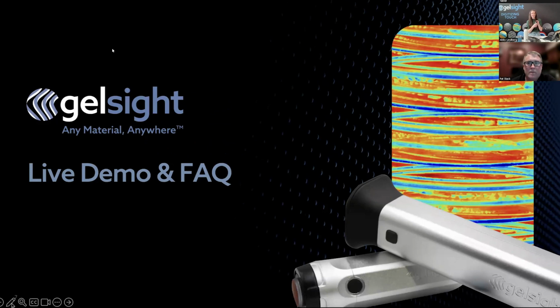And then the accuracy in the system for the Series 2 that I'm holding now is 1 micron plus 4% of the nominal, which in Imperial is 0.03 thou. So we'll definitely be able to pick that up even with the Series 2 system. And we do even have a Max system, which is our higher resolution system that goes down to 0.3 micron, or 0.3 micron plus 4% of the nominal.